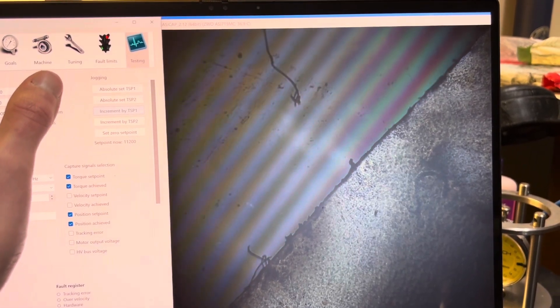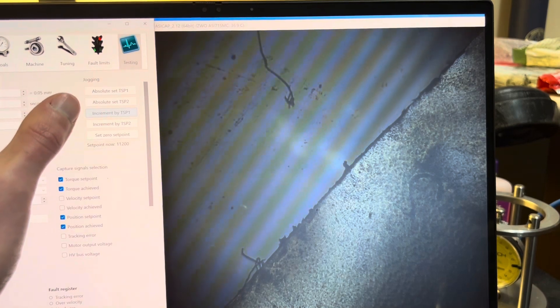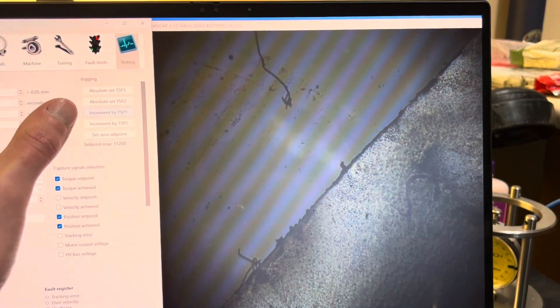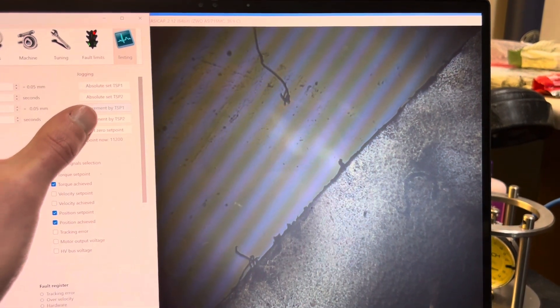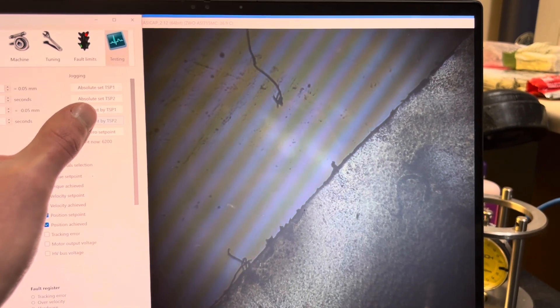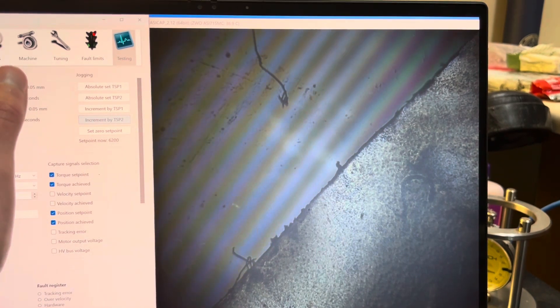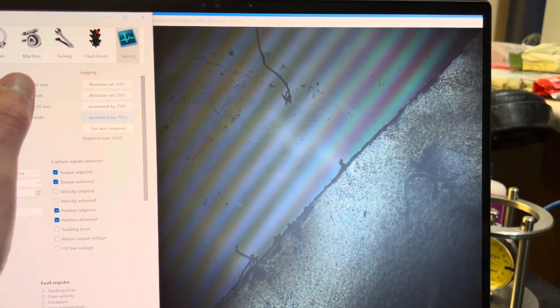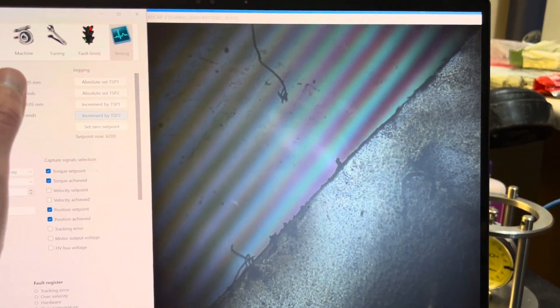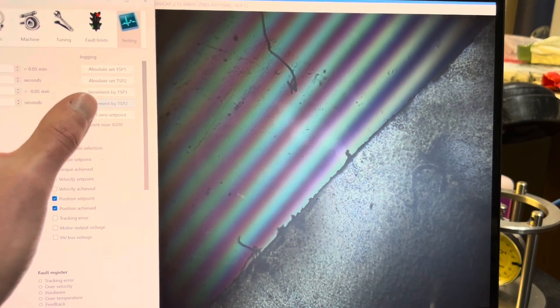That's one direction. You can see the fringe contrast start to fade as we get farther and farther away from the point of best contrast and that coherence length starts to be exceeded. Go the other way.